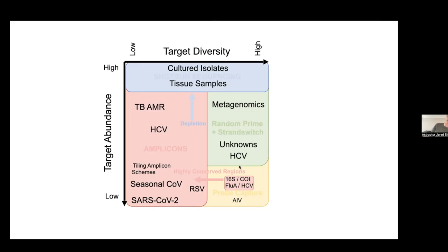So just because you've done some sequencing doesn't necessarily mean the results are reliable. And this idea that you have a high amount of human or host background DNA is certainly a challenge that we faced with CanCOGeN, our national project to sequence SARS-CoV-2. The very first step of the pipeline we're going to be using in the practical session a little bit later on is to map reads to both the human and coronavirus reference genome and throw out all the reads that map to the human genome.